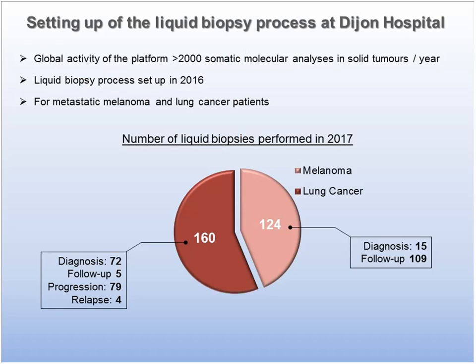For example, in 2017, we performed liquid biopsy analysis for melanoma patients, mainly in the context of follow-up, whereas for lung cancer patients, it was mainly in the context of diagnosis and progression.